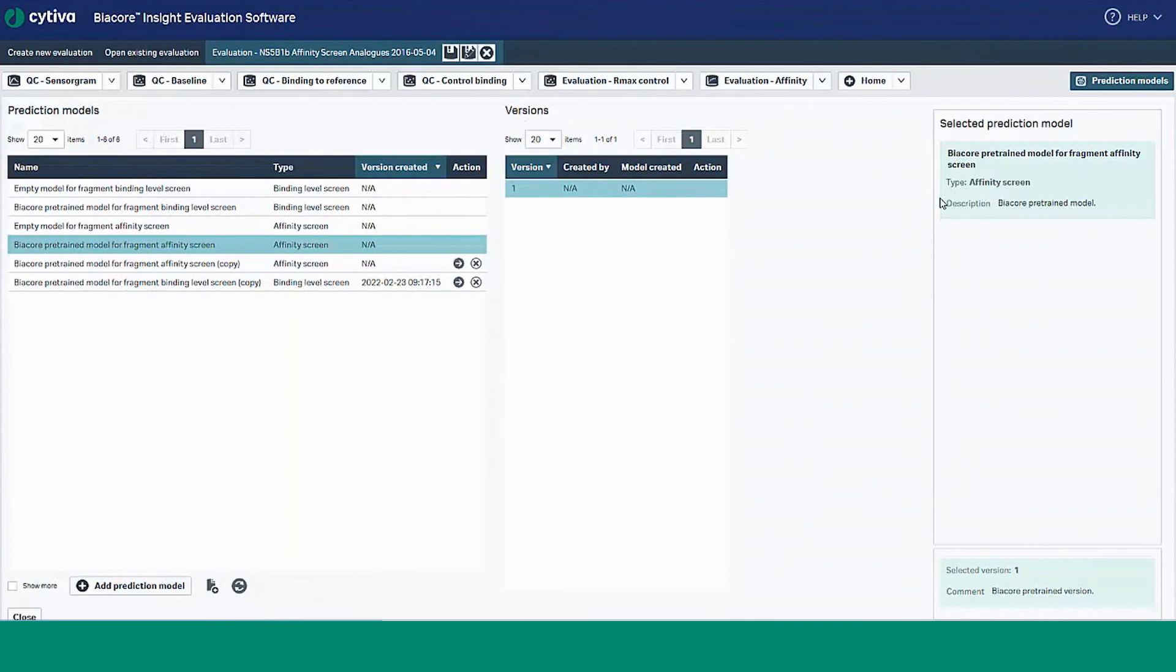You can add descriptions to describe the model and use the annotation feature to keep track of different versions of the same model.